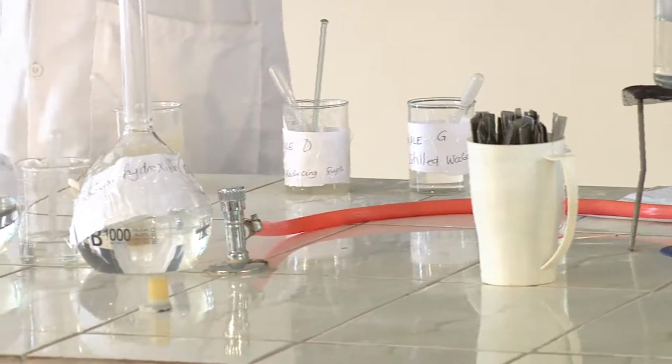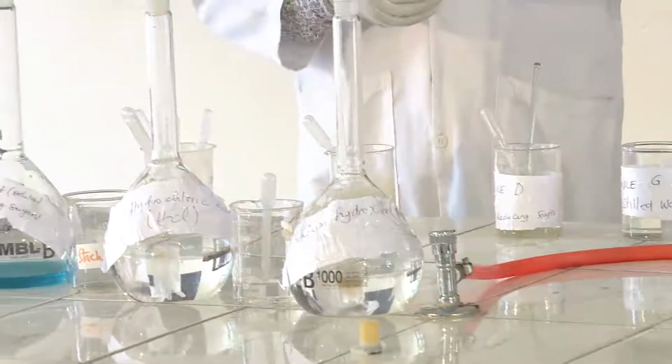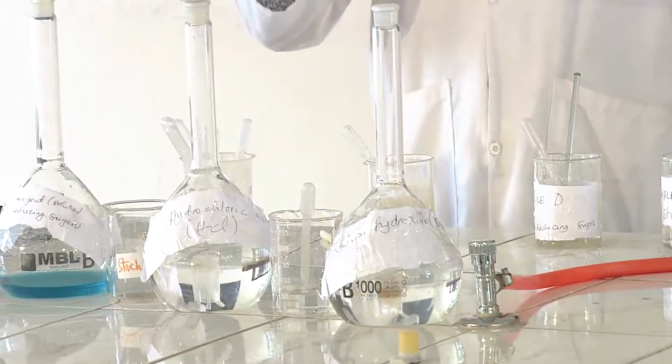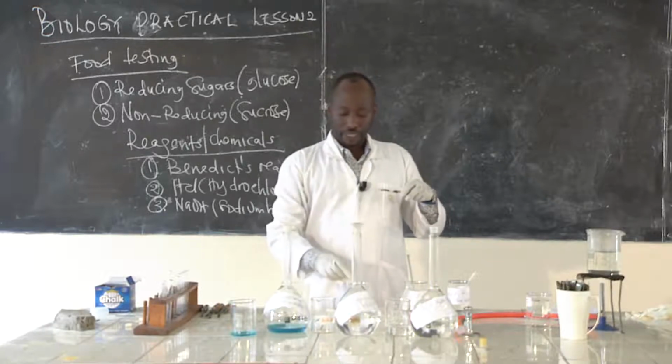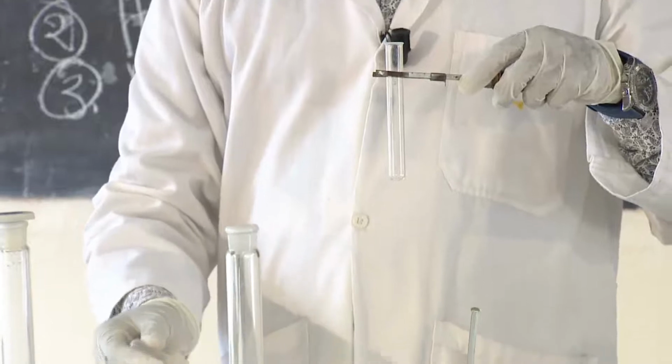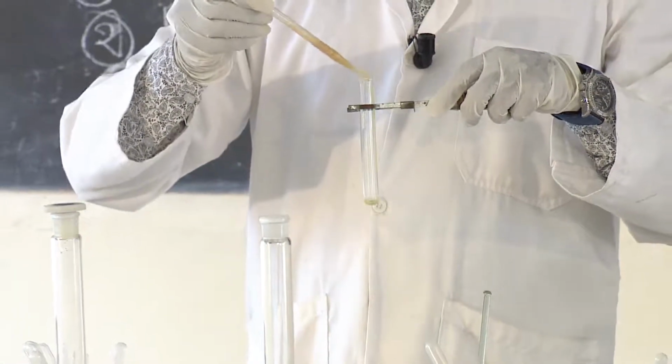All right, let me put on the gloves to protect myself. So from there, I'm going to get a sample. I will use an equal amount of the solution. You get about 2 centimeters of the solution, and you put in about 2 drops.